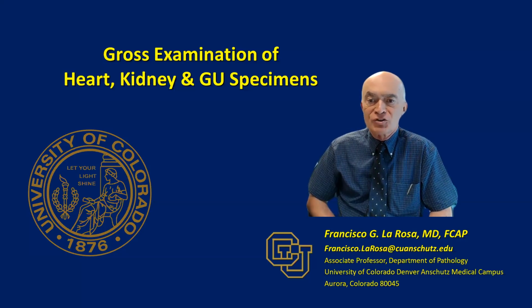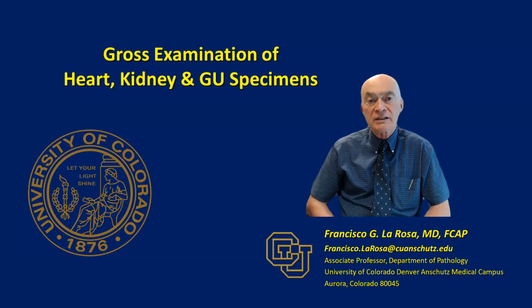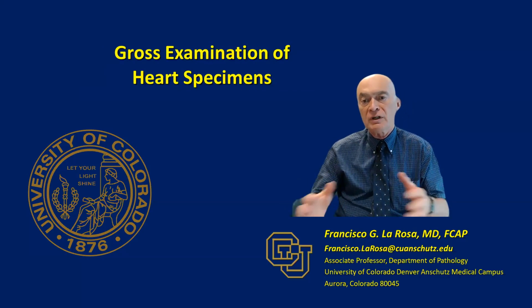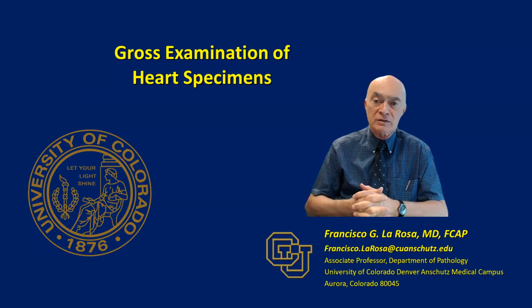Hello, I'm Dr. La Rosa, and today we are going to review the gross examination of heart, kidney, and genitourinary specimens. We're going to start with the examination of the heart, in which we need to remember that there are two different possibilities that we can have a heart specimen.